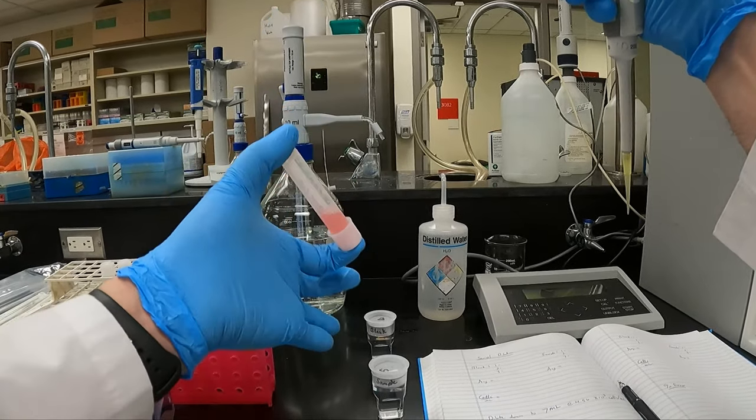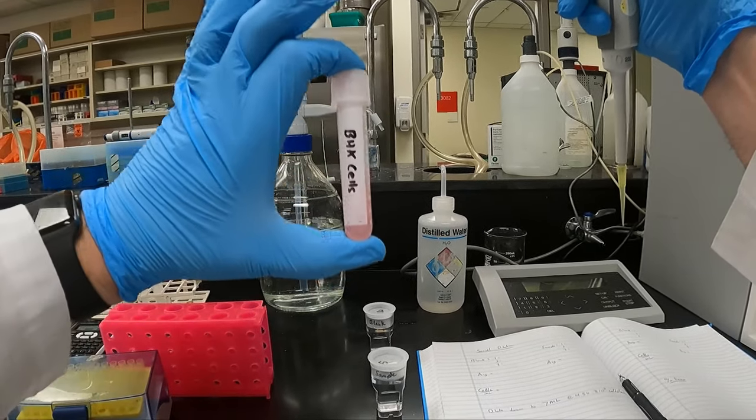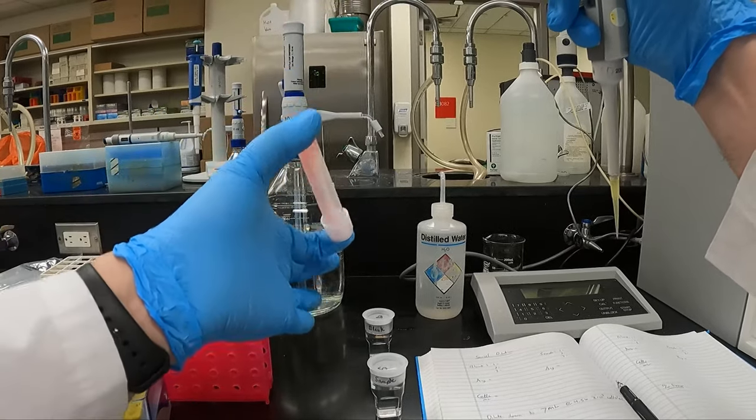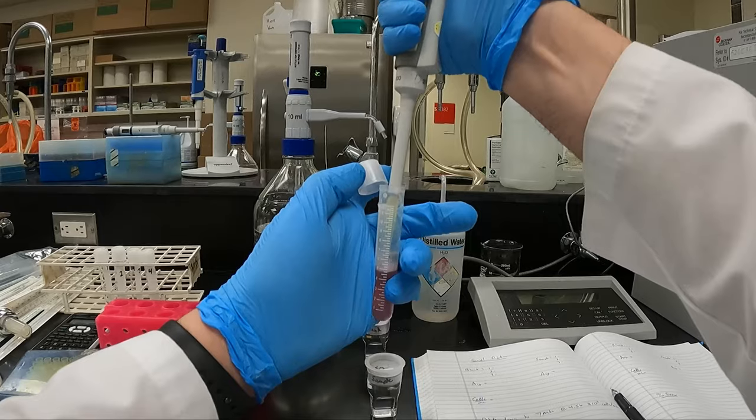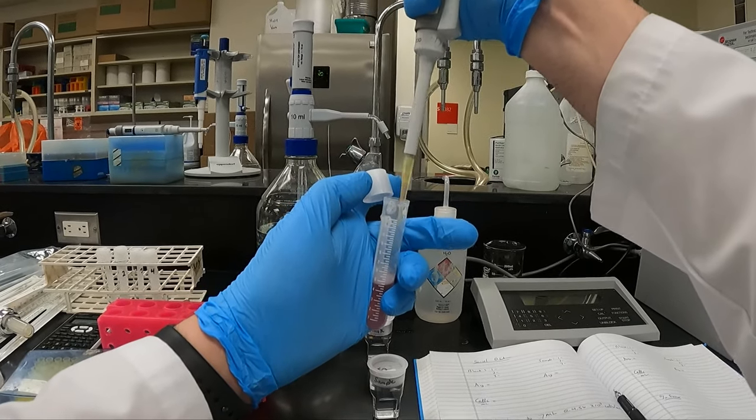Before you sample the BHK cells, make sure you mix them thoroughly. Remember, the cells aren't dissolved, they're suspended in solution. They'll eventually sink to the bottom. Mix it and pull out 200 microliters.